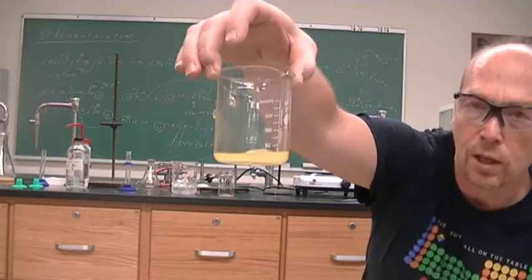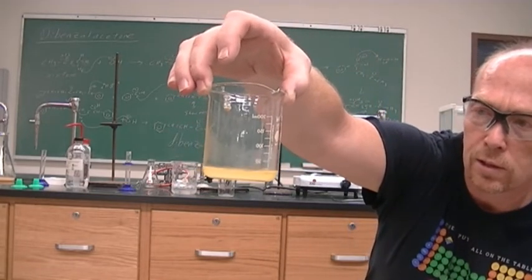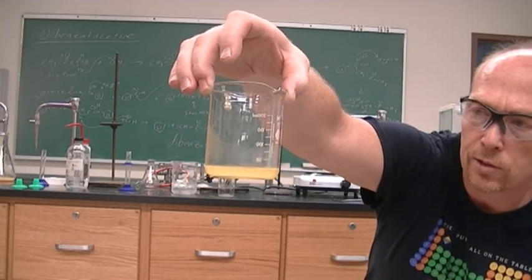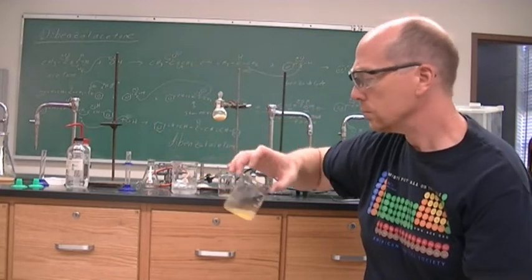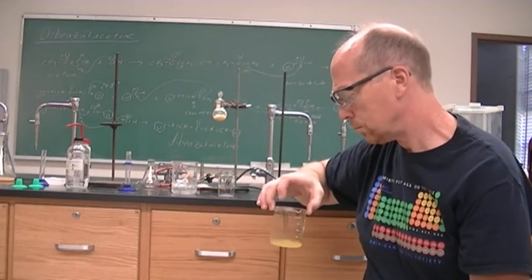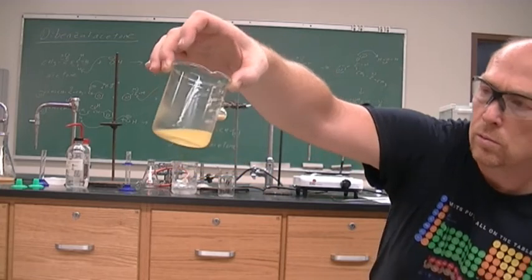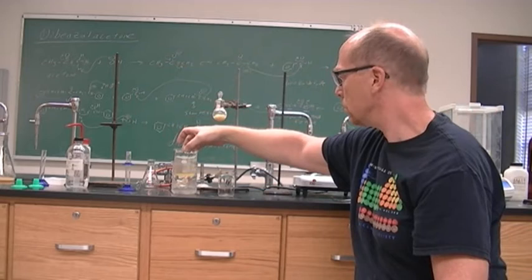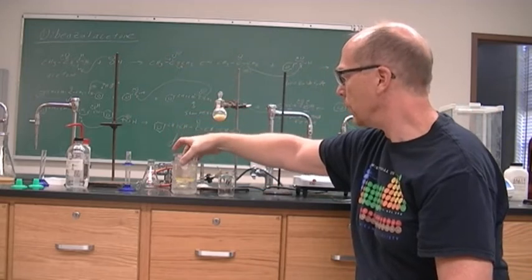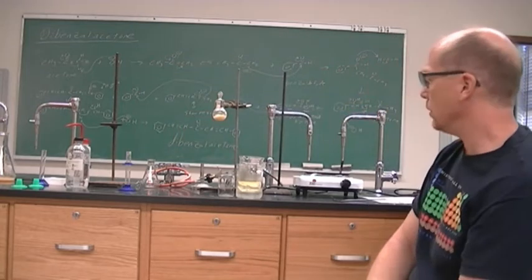Okay, so solid is being formed in there as it is cooling down. And we can increase the cooling by setting it on top of some ice here.